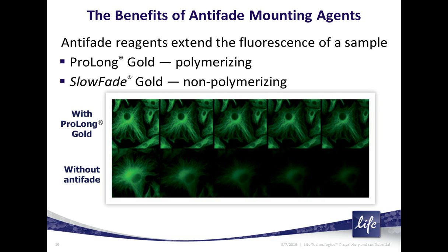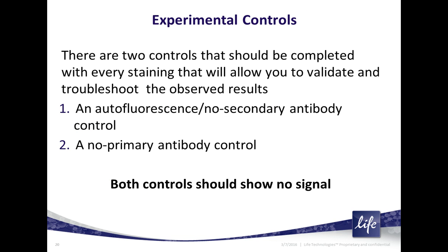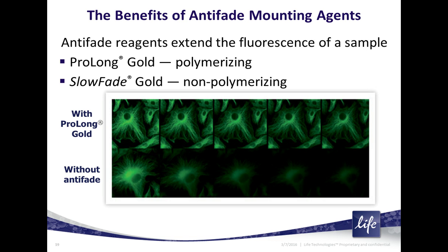Instead, it stays liquidy, sort of like a glycerin or a glycerol solution. That is, it's non-polymerizing or non-hardening. And that's fine if you want to just take a look at your sample right away and then throw it away and don't care to archive. There are a lot of other mountants out there. You want to check to make sure that they have an antifade component in them.